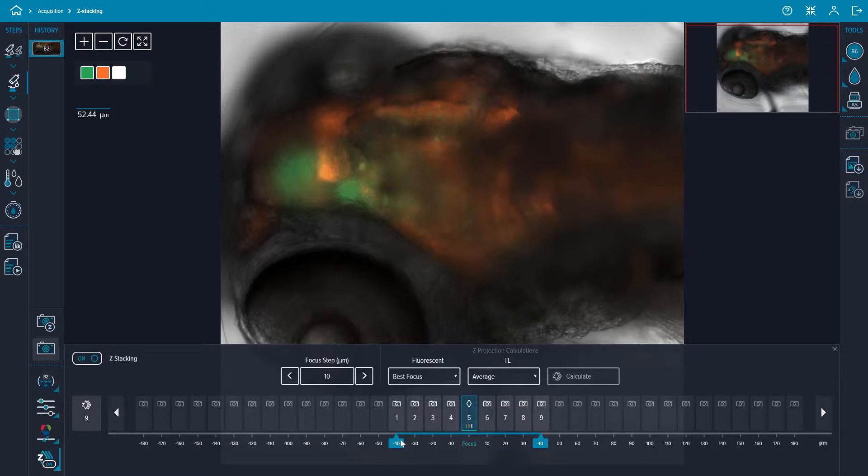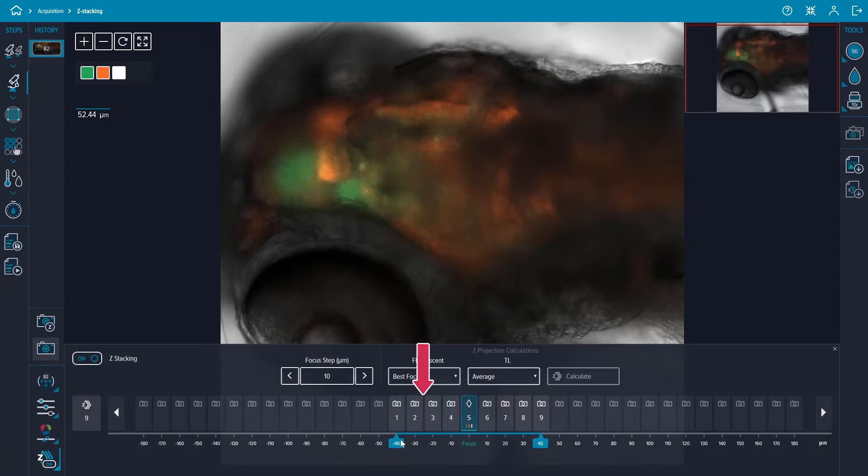The z-steps in the z-stack will be centered around the focus offsets configured in the first acquisition setup step. This can be seen by the highlighted focus plane in the middle of the z-stack preview bar located in the bottom pane.